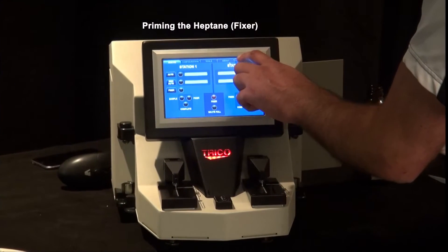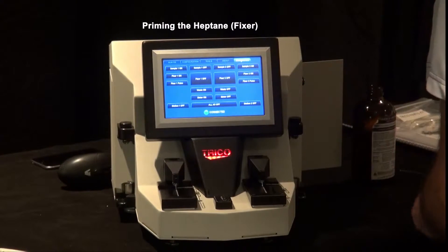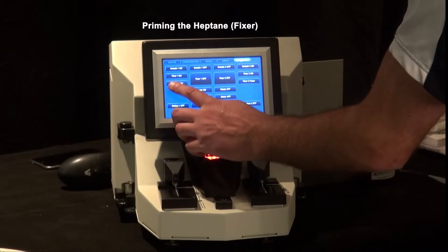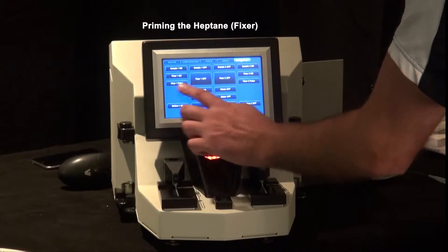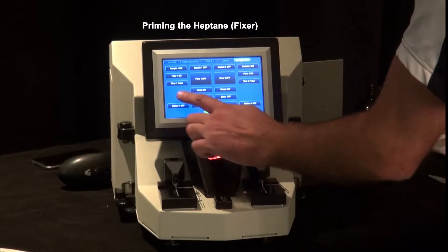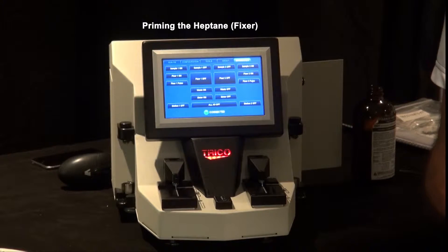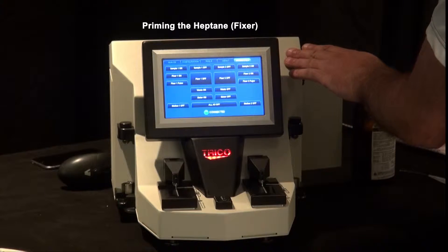We're going to go into our diagnostics screen and select diagnostics. Then we're going to set our fixture pumps to pulse — you have fixture one pulse and fixture two pulse. Press both of those and you'll hear a small clicking sound inside.